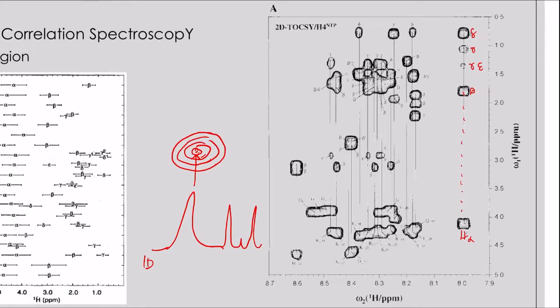If you look at this particular fingerprint, there's no other amino acid that will have the same fingerprint. You have alpha there, and then beta, which is very high density, and another very high density one, then the smaller ones. So this identifies that this is isoleucine.